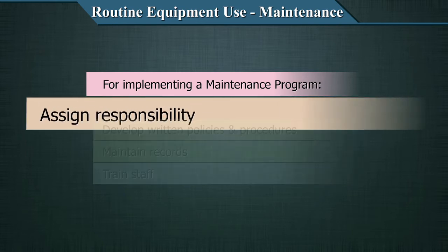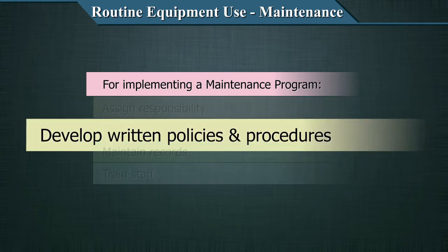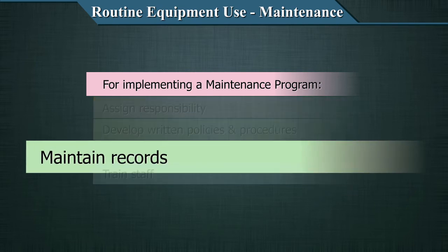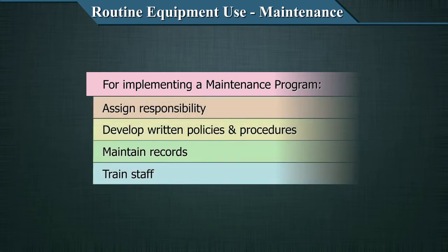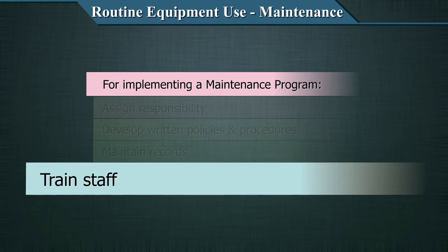Assigning responsibility: generally, the frontline staff responsibility is for the person who is authorized to do the work or his deputy. Periodic checking should be done by the quality manager or whoever has the appropriate authority. There should be written policies and procedures about who does what, up to what level, and how to escalate a process in case of breakdown. Records should be maintained for everything done, and staff should be trained to maintain records.